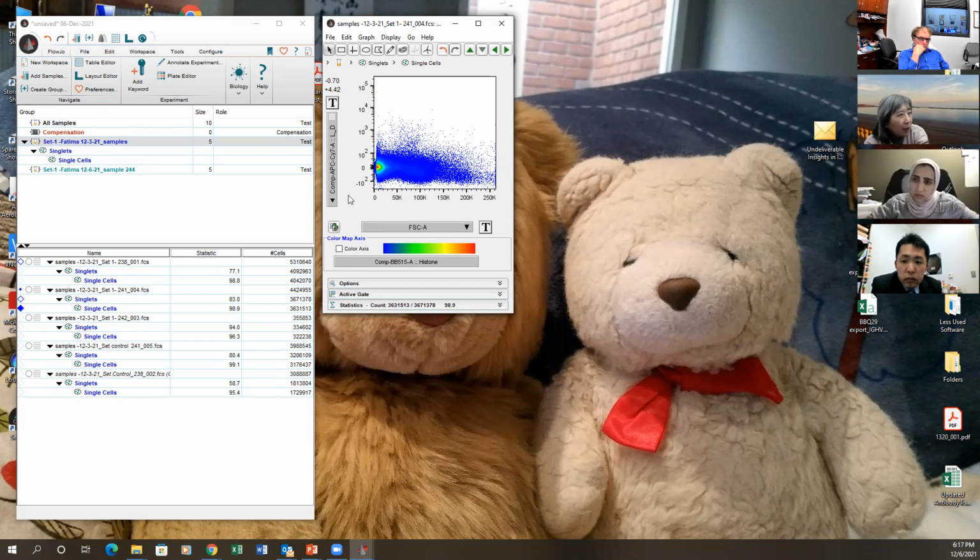I think the rule of thumb is when you run this flow cytometer, make sure the setup, the configuration, is identical. That's right. Once you set it up, you always just go there. In fact, that makes it easier for you too. Yeah, that's what I did. Then from different batches, I can run them together at the same time. And if that's not the way you run it, we have to force gate it when you run in the same batch.